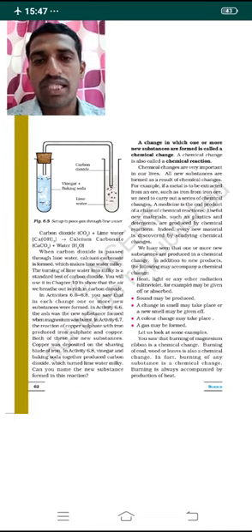Okay, that is passed through a test tube to another test tube containing freshly prepared lime water. So immediately when that carbon dioxide gas formed, the new substance passes through and reaches the lime water, and it turns milky. So look at the reaction here. Second new substance, what will happen, let's see.